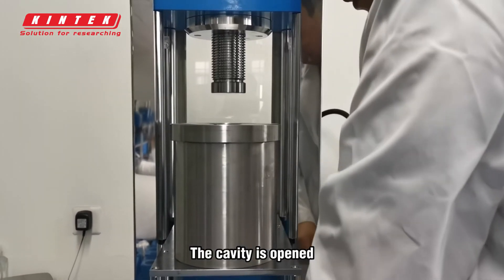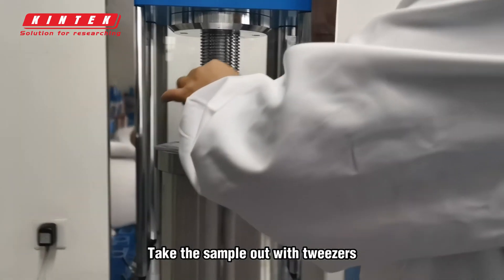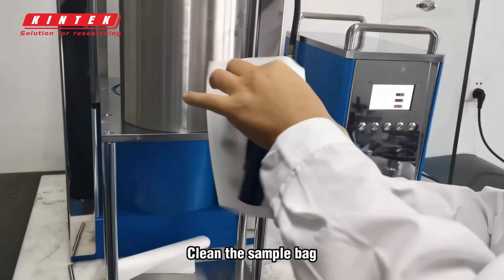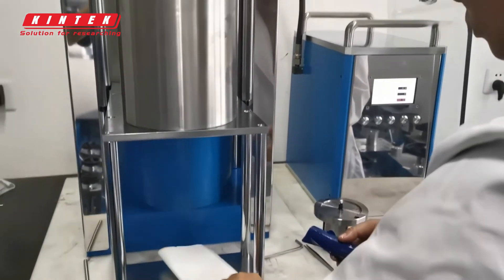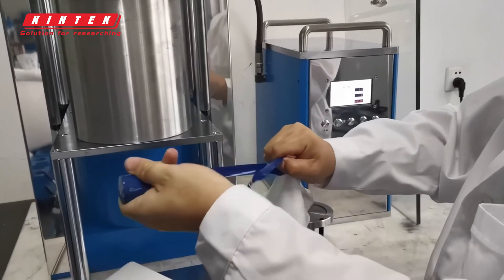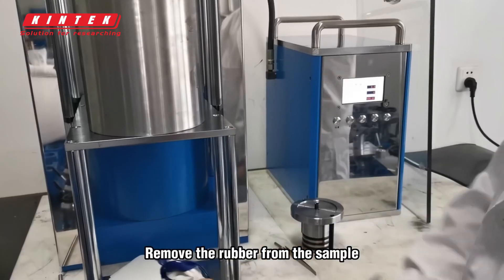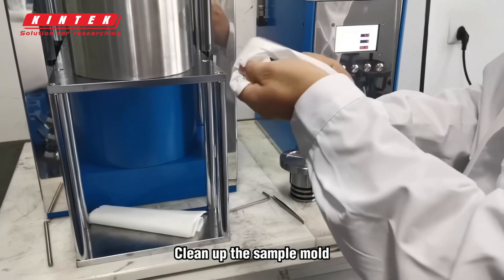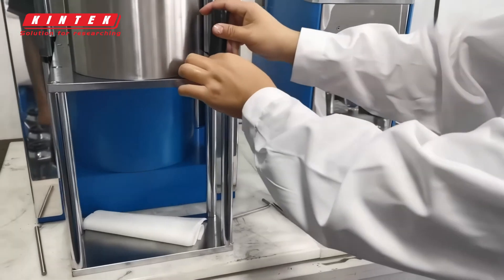The cavity is opened. Take the sample out with tweezers. Clean the sample bag. Remove the rubber from the sample. Clean up the sample mold. Take out the sample.